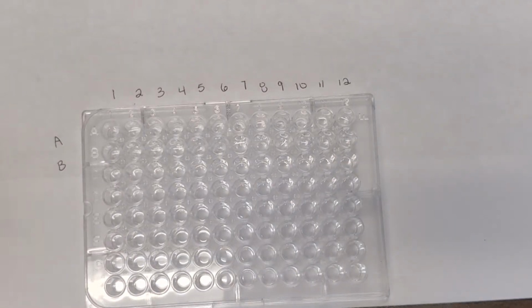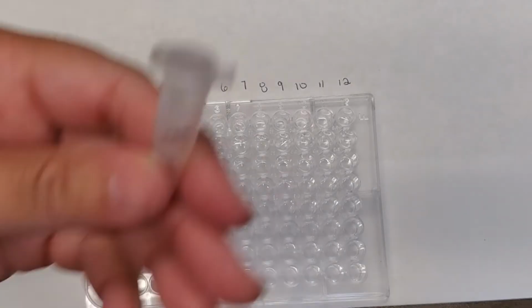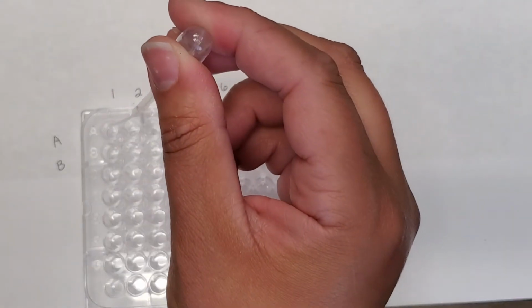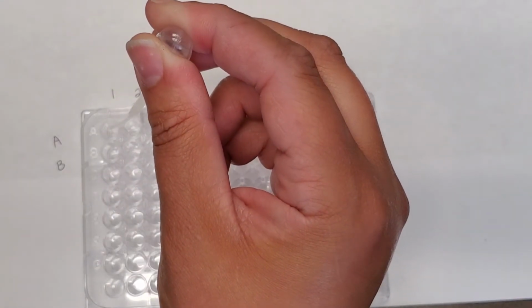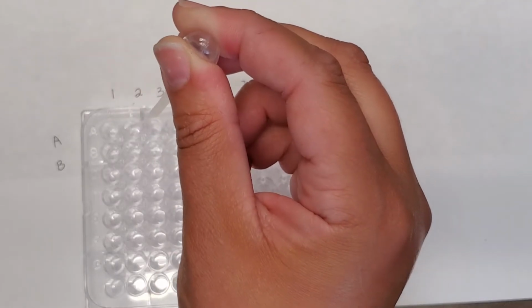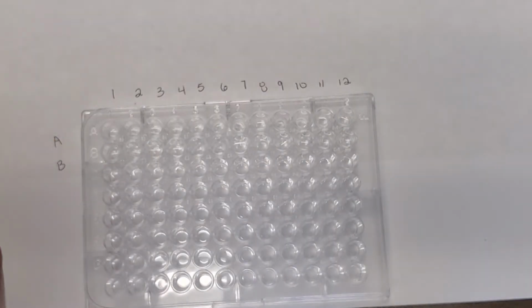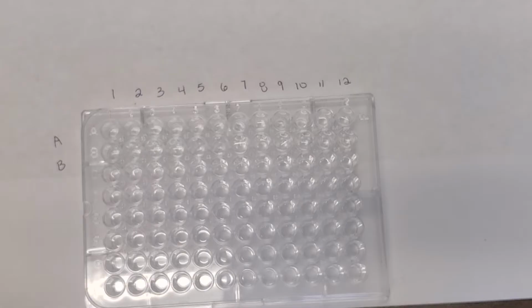So once that's done, I don't want to cross-contaminate, so I am immediately going to place that used pipette to the side. So now we are going to add the samples. The first sample that we're going to use is our negative control. In this sample, it's basically serum that does not have the antibody in it. So I'm going to add 3 drops into row A, wells 1 through 3, because remember, we're testing this 3 times to make sure that we're testing each patient correctly. So that's our first one. It's just our negative control, so we should not see a color change with the ELISA.